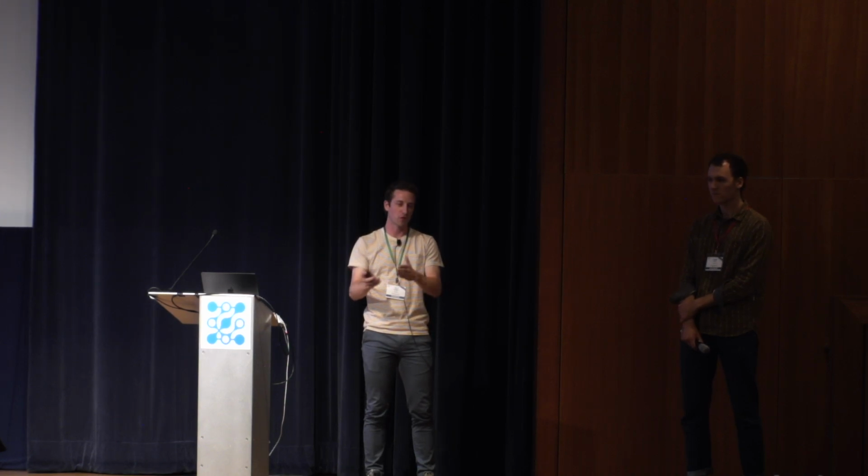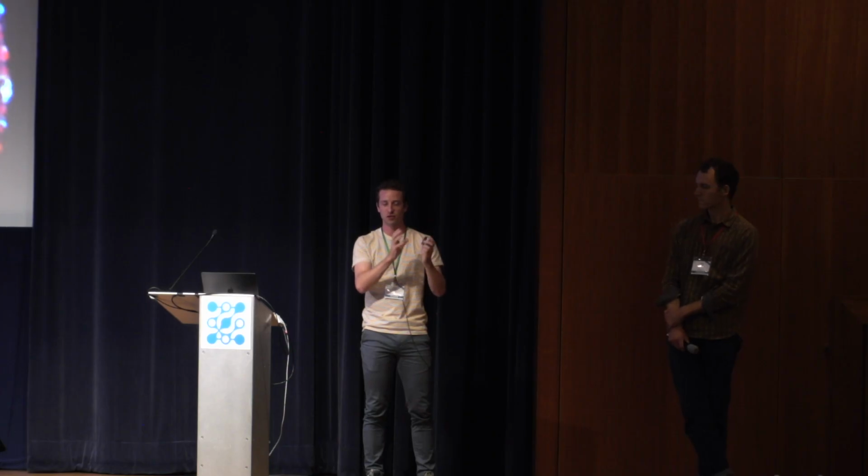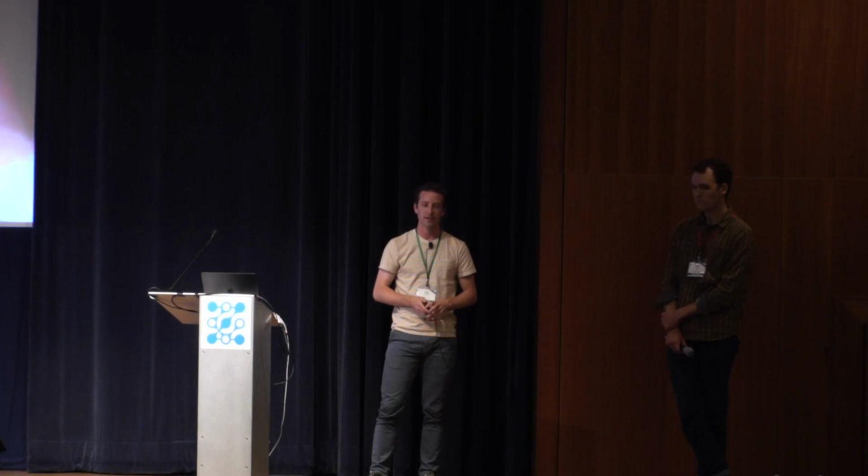Once we go to a more deep learning framework, then you can have data sets where you train these parameters and find the best ones. Or right now we also have options where you annotate a small section of your data set, and once you have a little ground truth data set, by doing a parameter sweep on that, we can find the parameter ranges that help guide it. But as with any method, there's still some tuning involved. Ideally that becomes less and less over time.